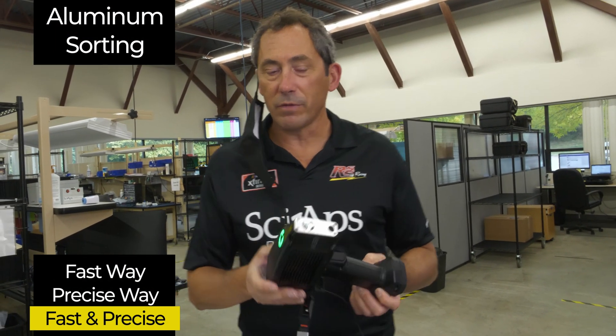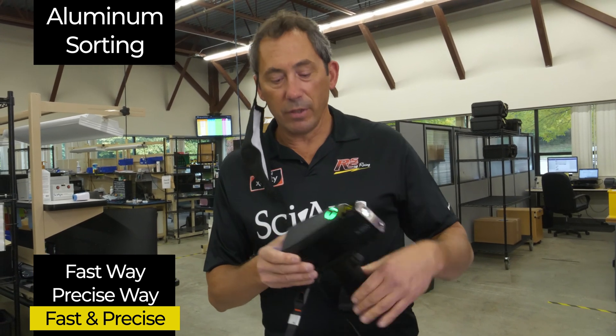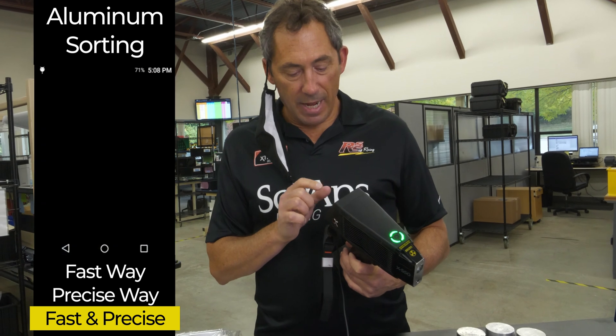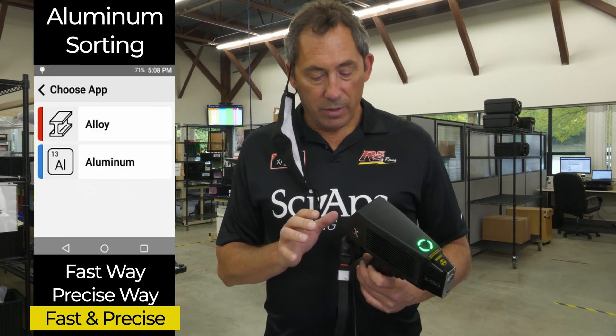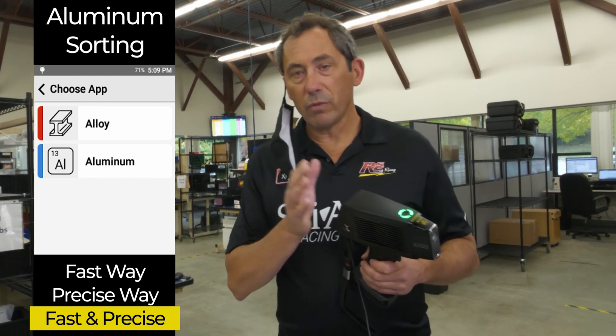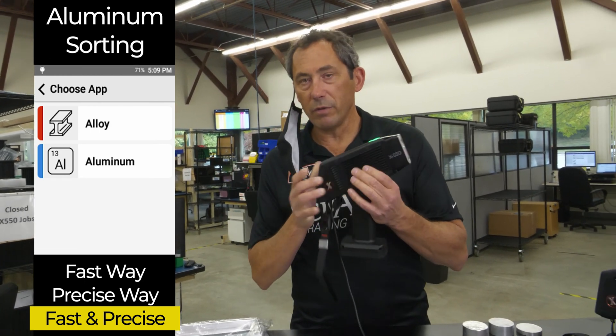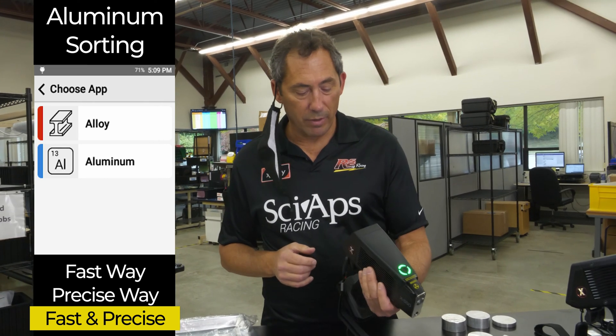This is the third in a sequence of three videos. What we're showing in this video is what we call the aluminum app — an app that we designed. So if you are going to sort aluminum all day long, or if you use one of these new X-Ray guns — the lightest, smallest one ever made — if you use one of these at an aluminum sorting area, we created an aluminum app on the gun.